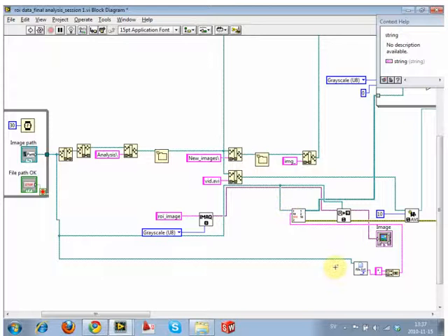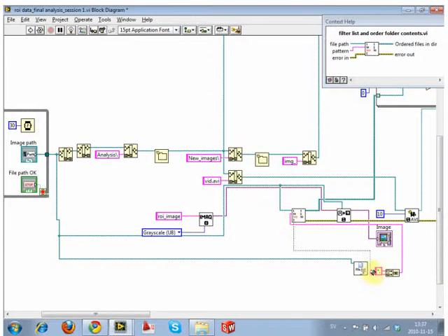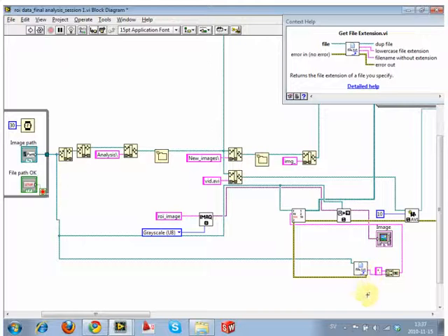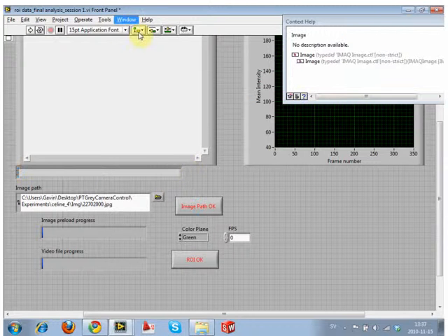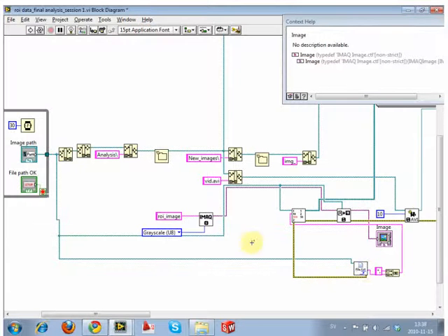Everything else will happen as is, but just for clarity, wire the arrow over too, so that the structure flows a little bit easier. And that's it. We essentially have solved the naming issue. We now only choose files that have got the same extension as the file we choose. Well, that one's kind of a quick patch. Now we'll look at where we're going to put things.